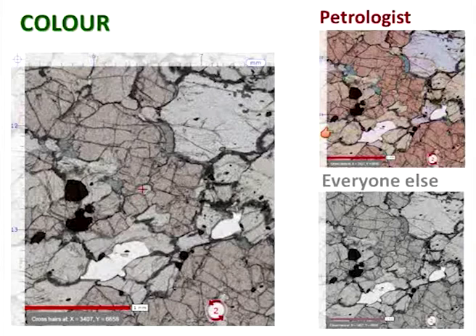And what you'll find is that the more slides you look at, the more you become like a petrologist, and you start seeing far more colours in all the minerals. The problem, of course, is that there are all sorts of variable factors at work, and we'll look at those as well. But here you can see this is the same image. I've literally just increased the saturation.